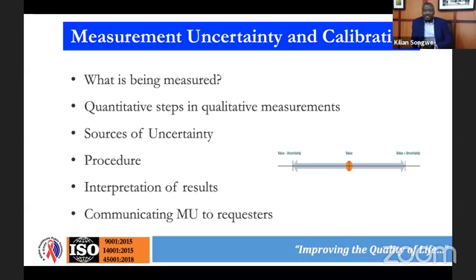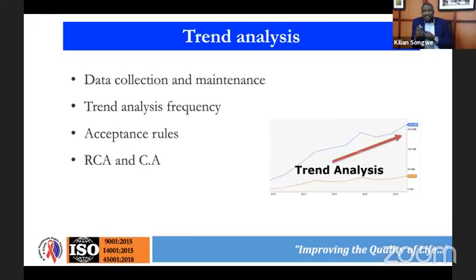And then also it's important to establish the sources of uncertainty, because if you don't know them, you cannot quantify the uncertainty. So it's important for the lab to define the sources where this uncertainty is going to come from and establish a procedure to be used to calculate the uncertainty of measurement. Now, uncertainty of measurement is particularly important whenever you're using any tool in the lab. For example, a pipette, a measuring tool like a thermometer, a measuring tool like a weighing balance, anything that you can use to measure, you have to establish its measurement uncertainty by ensuring that its uncertainty is available.